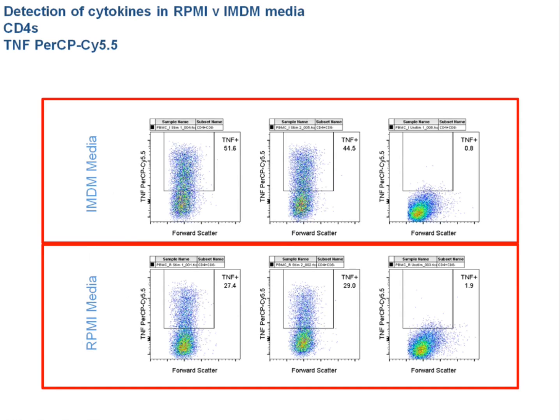Okay. Another question is, monensin block possible for live animals before necropsy for tissue? I think I've heard something about that, but again, I think the problem with live animal treatment of that is, you really have to think about what else you're affecting. So you're not just preventing cytokine release, but you're preventing really the release of all proteins. So in a live animal, you don't know what other systems you're affecting.